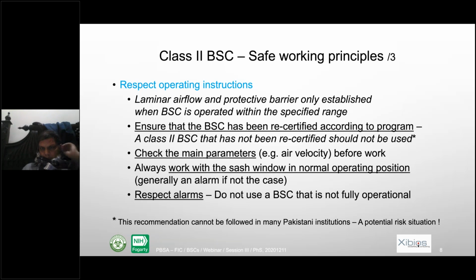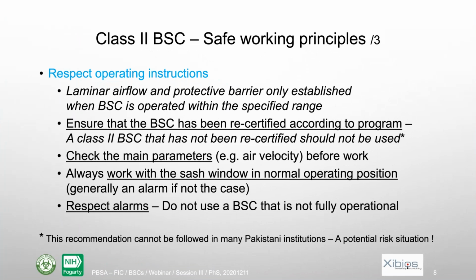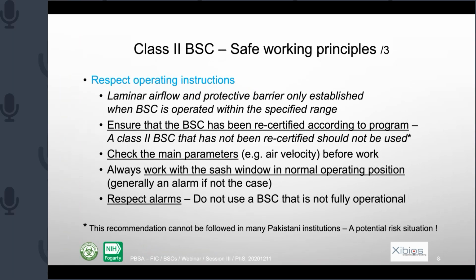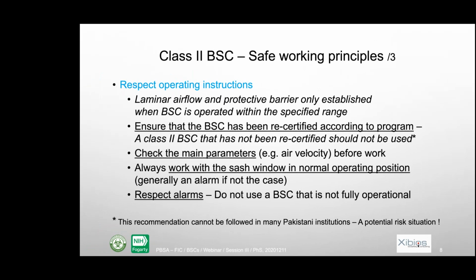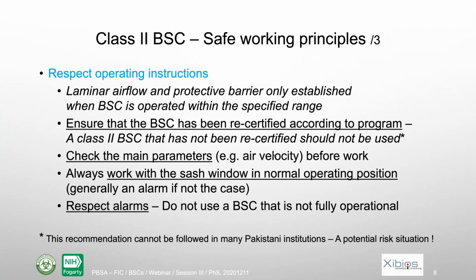And then the last measure there is to respect the alarms. Alarms are there for some reason. When there is an alarm, you should stop working with the biosafety cabinet, because it means that it is not fully functional anymore. And so you should have it checked and repaired in that case. There are still some cabinets where it's possible to shut down the alarm. This is a very bad thing to do. If you do that, you will keep working, and you might forget to put it back on after that. So that means that the next people might also be exposed. So we definitely need to respect the alarms.